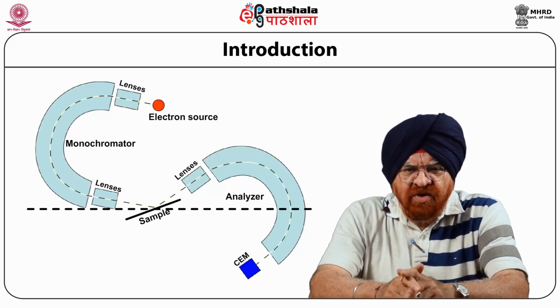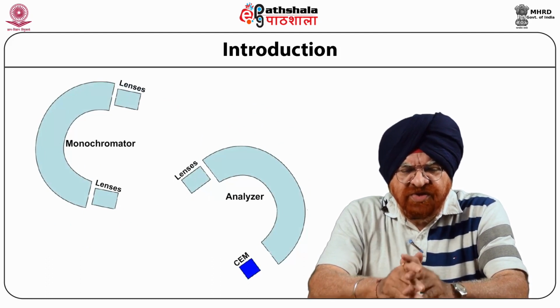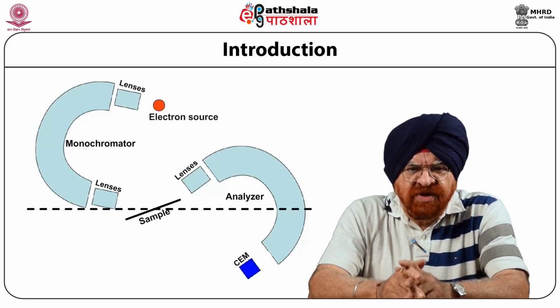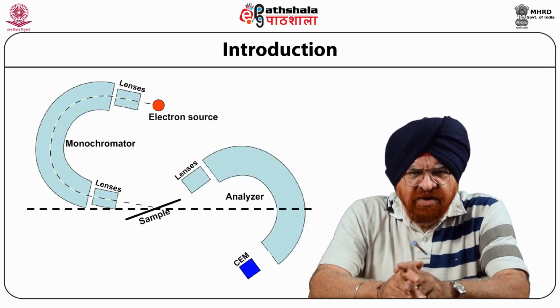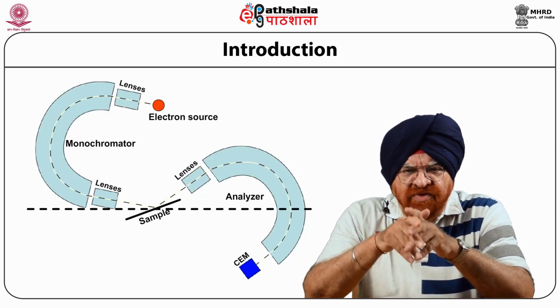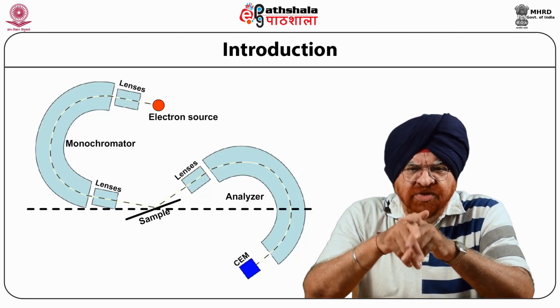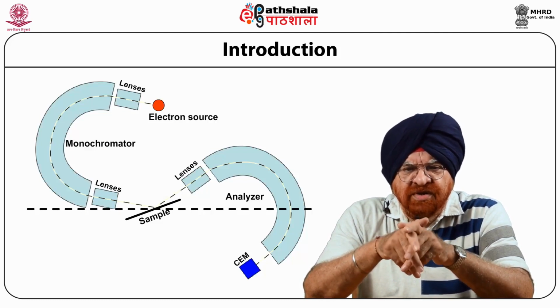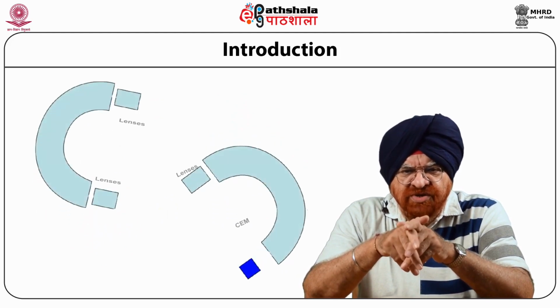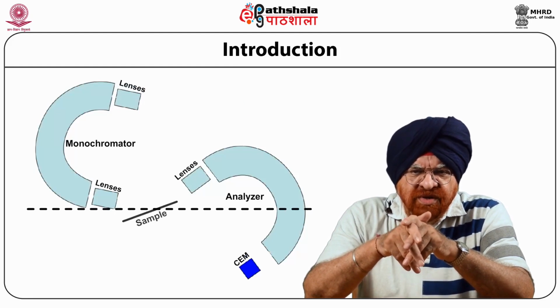This scattering of these electrons can excite the electronic structure of the sample. If the scattered electron loses the specific energy, that is delta E, which is needed to cause the excitation, then obviously we will study that part with the help of this. Those scattering processes are called inelastic scattering processes. The energy for this excitation is taken away from the electron's kinetic energy.